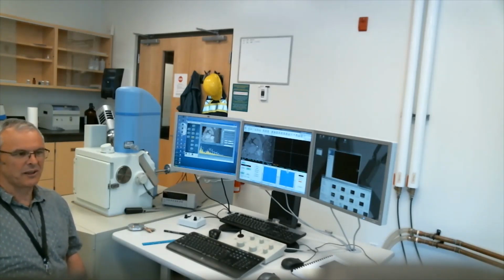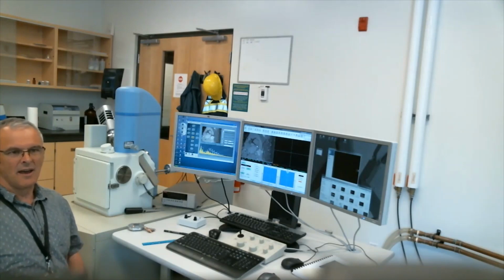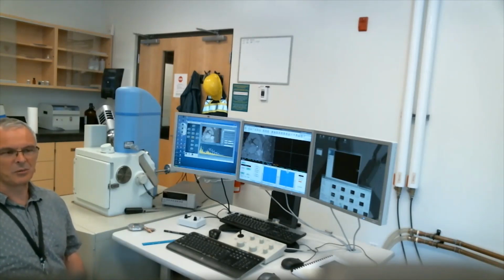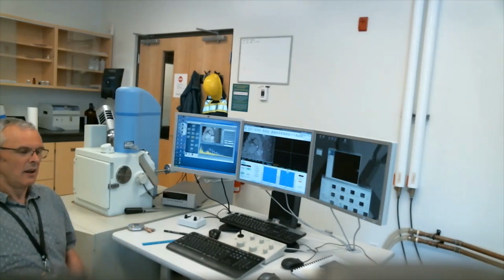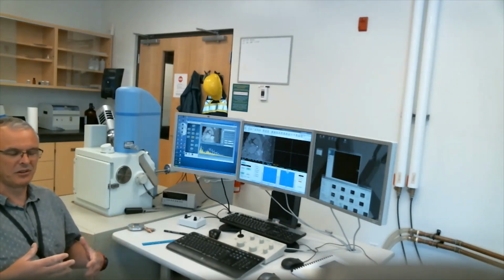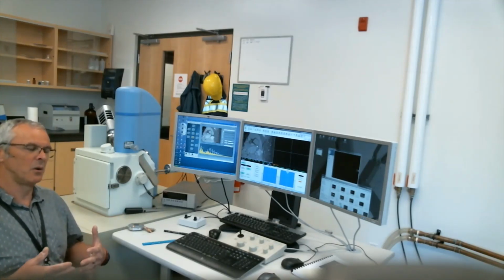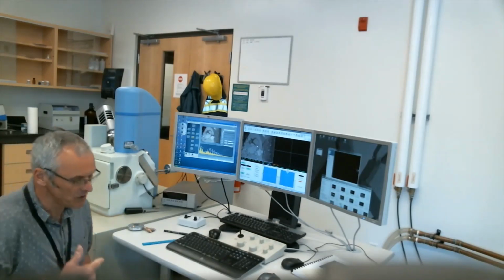And the geometrical effects as well. I had one of these crystals and I measured X-rays on one side and then the other. And the difference in phosphorus was 15 weight percent P2O5, depending on where I looked at it. So geometry as well. This is all really great stuff. You need to be careful when you're looking at this type of data, when somebody shows you this data. You need to be a careful consumer of EDS data. You have to know how it was acquired, okay?